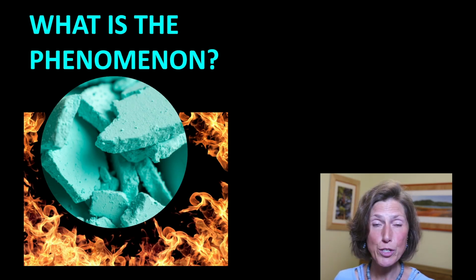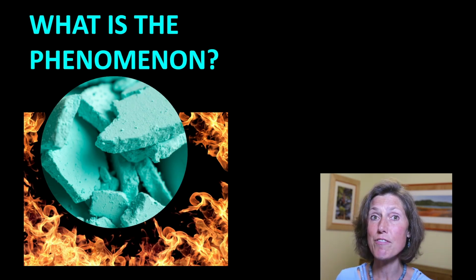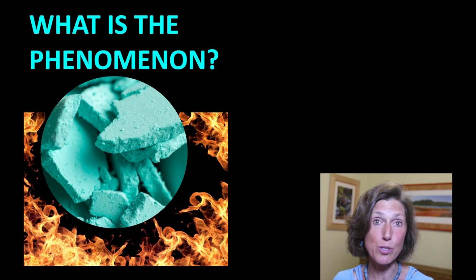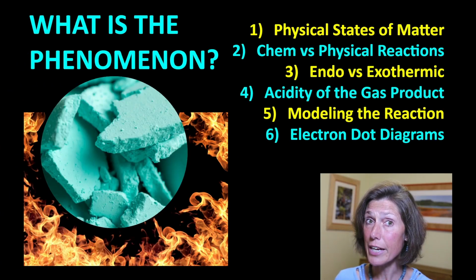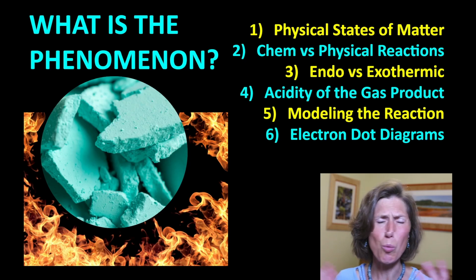carbonate, and I'm going to focus on 6 different questions relating to 6 different concepts that can literally be extracted, so to speak, from this particular phenomenon. Let's get started. First, I encourage my students to ask, what again are the physical states of matter?